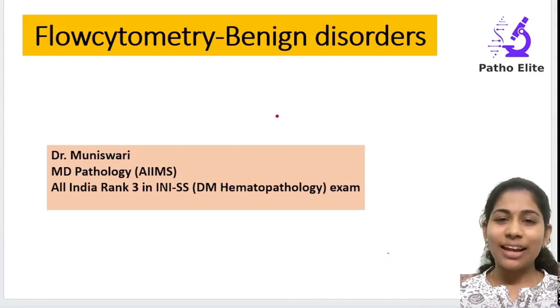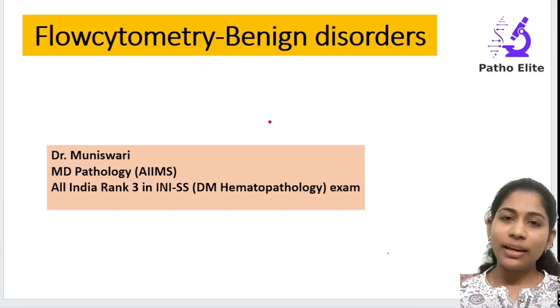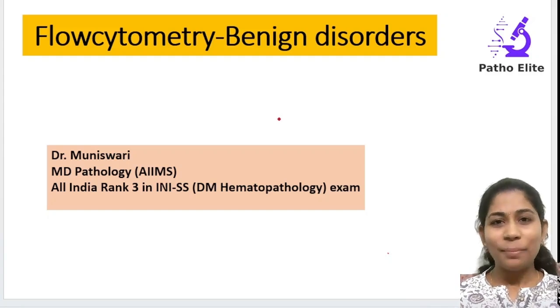Today we are going to discuss another important topic, that is flow cytometry in benign disorders. We already discussed the components, the principles, and everything regarding flow cytometry. Now we will discuss its applications, especially in benign disorders.